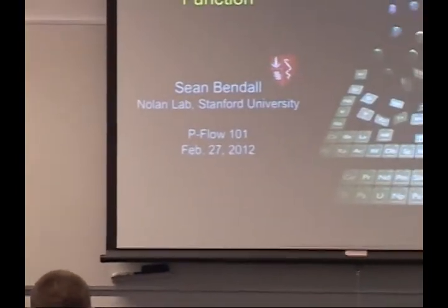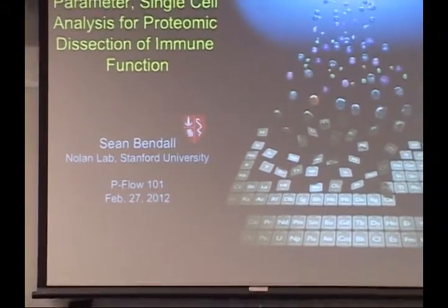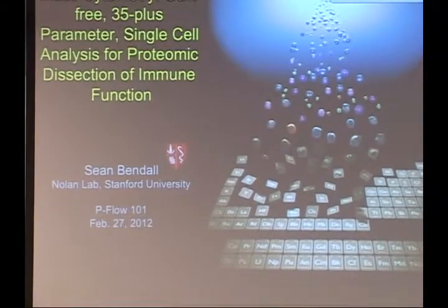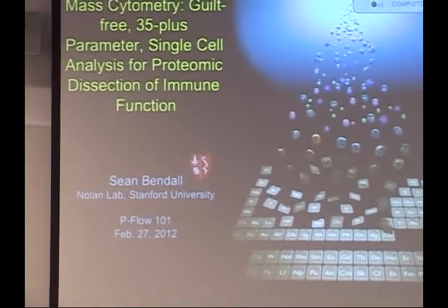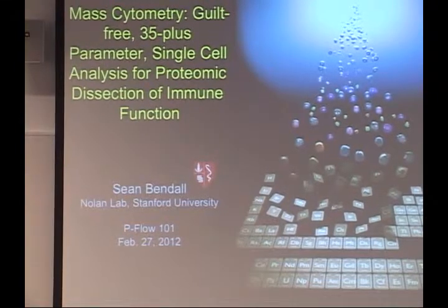All right. So I don't think it's going to be quite into the deep end because people are going to be talking about the higher end kind of applications we've been using mass cytometry for over the next couple days. But I'm going to give you guys a little bit of an introduction to the technology and talk about kind of how we used it, why we needed it, and some of the basics behind it.